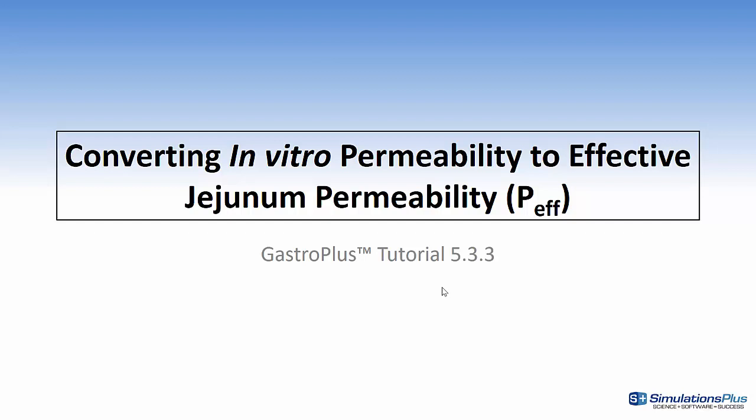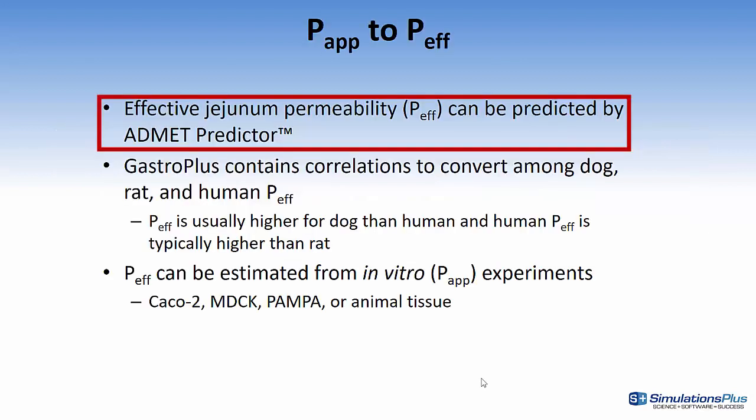Hello, this is Mike Lawless, and in this video I'll discuss converting in vitro permeability data to effective jejunum permeability. I will be going through GastroPlus tutorial 5.3.3 to illustrate this process.